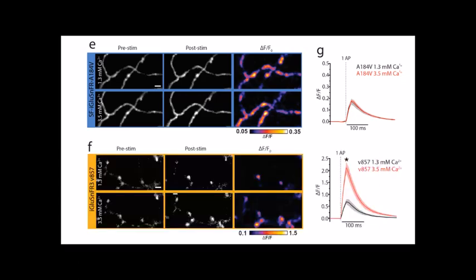And then he did the same experiment with iGluSnFR3, and now we actually see the increase that we expect from electrophysiological studies. Also, these responses are much larger in amplitude in general compared to the previous indicator, which I already showed you.